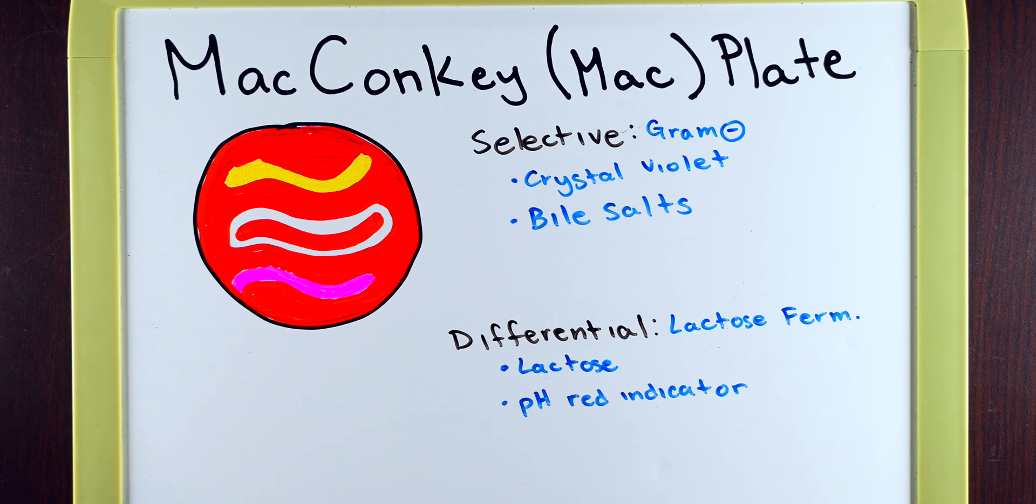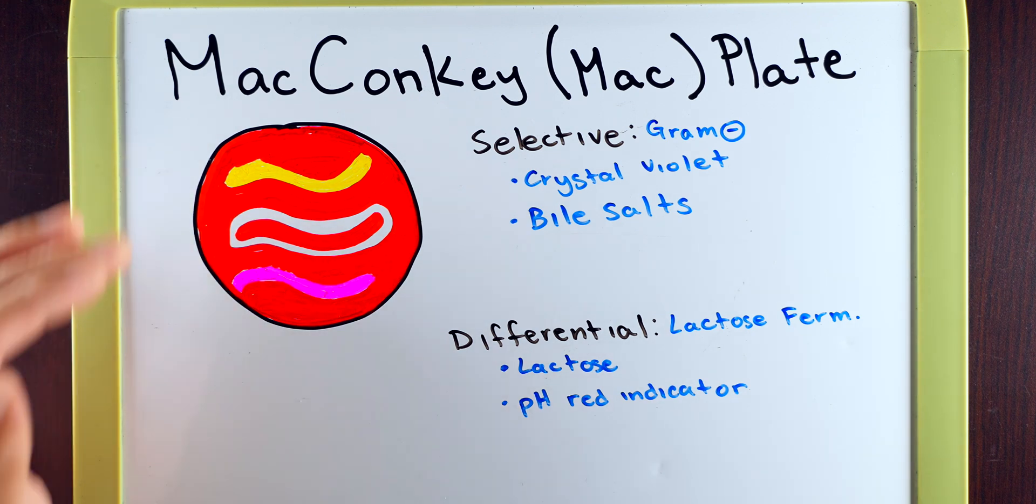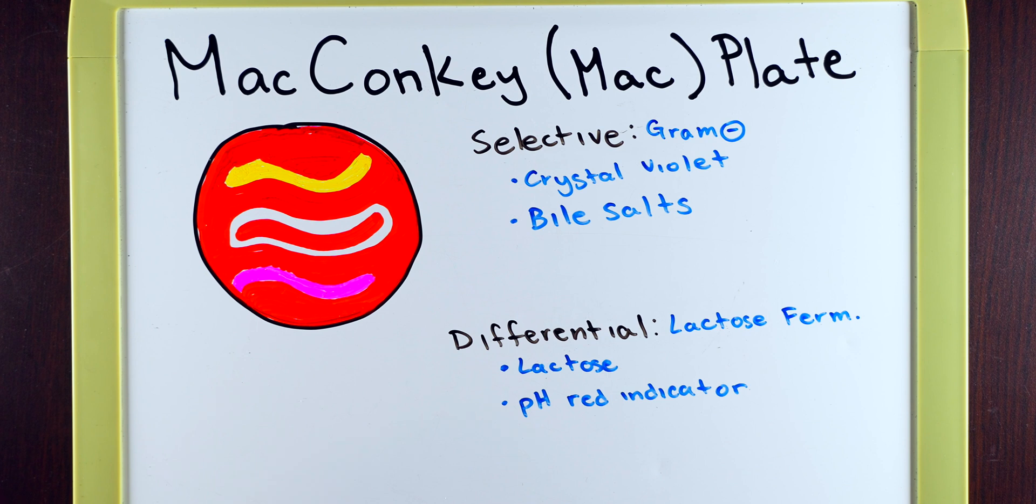Now, when we're looking at the results, we can see that we have three different results here. The first one here in yellow. This indicates to us that we have normal bacterial growth on a plate, very similar to what you've seen prior, in which we have this clear to yellow bacterial growth on the plate, but it's not red. So we know that it's gram-negative, but it's not a lactose fermenter.